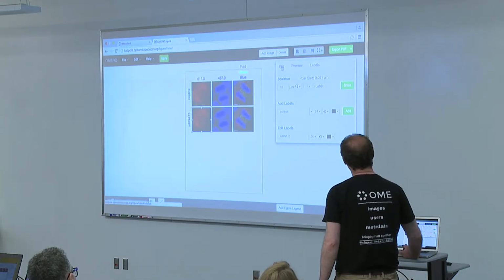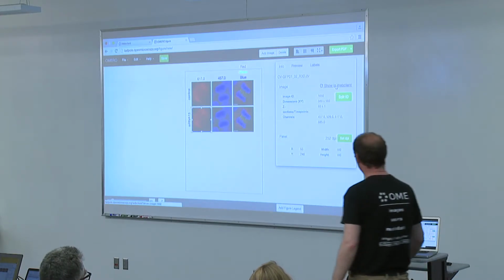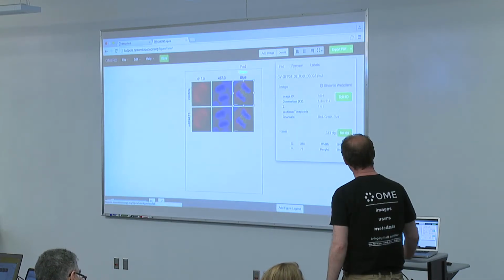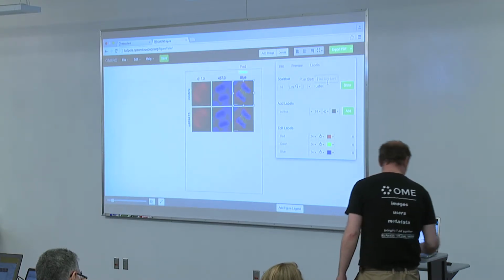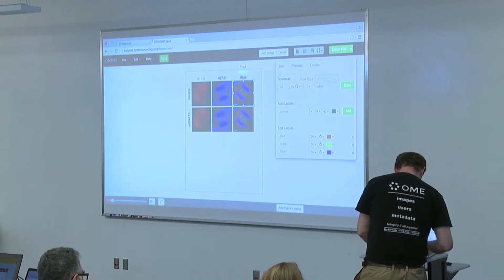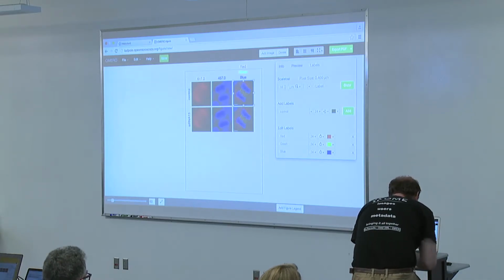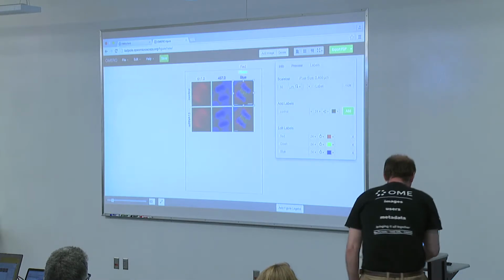I have a scale bar here which I can change. Why do I have the scale bar? Because the calibration of the image in OMERO was taken into account. So, yeah, it wasn't, but okay, I can simply calibrate it now. So this would be, let's say 0.4. Okay, and then I can make it bigger. Yeah, sorry.